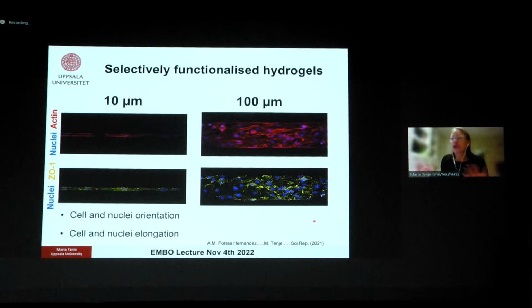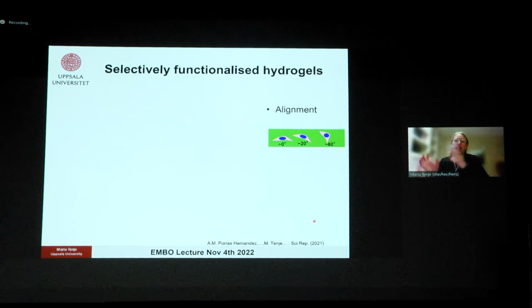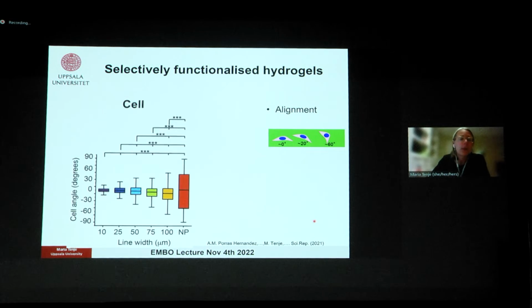So looking at these two extremes, we wanted to investigate the cell body and the nuclear orientation and the cell body and nuclear elongation. So alignment is simply a measure of, does the cell body realize that there is a line, and how does the line control the alignment of the cell? And if we then looked at the cell body for the different line widths, with the non-patterned control surface where there is RGD everywhere and the cells are not constrained to move, there is also no preference in the direction. And here we're looking at plus minus 90 degrees. The cells are just going in all directions.